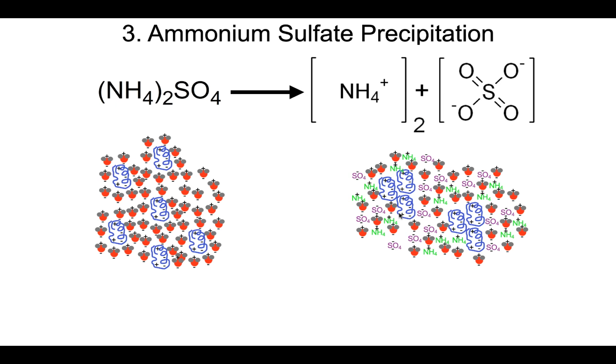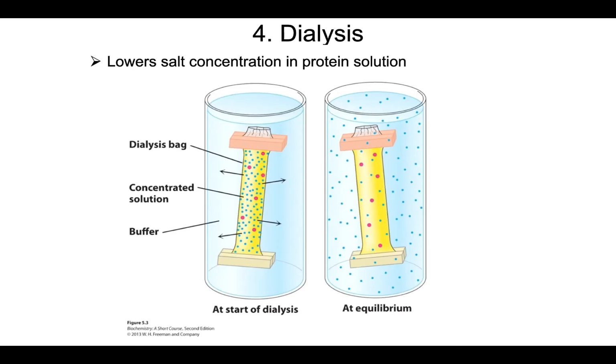protein. Or if your protein is very, very soluble in water, then you can precipitate out all of the other proteins and keep your protein, which is solubilized within this solution. But the problem is, at this point, even though you have selected your protein away from many of the other proteins, you have a problem. Number one, it's still a little bit contaminated with proteins, and number two, it now has all of this salt there that needs to be removed.